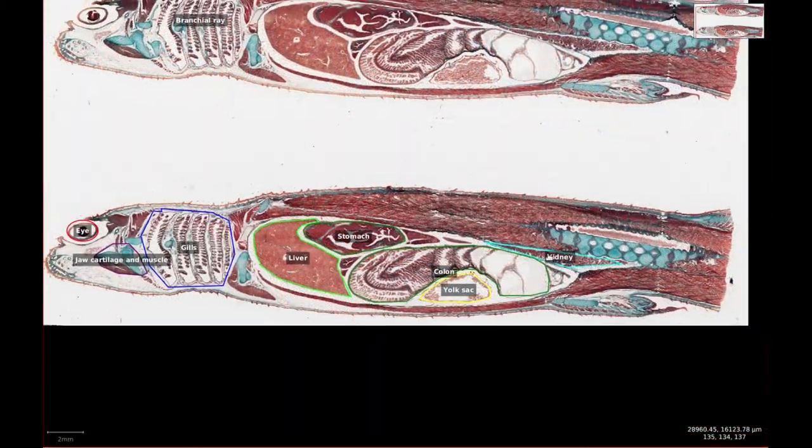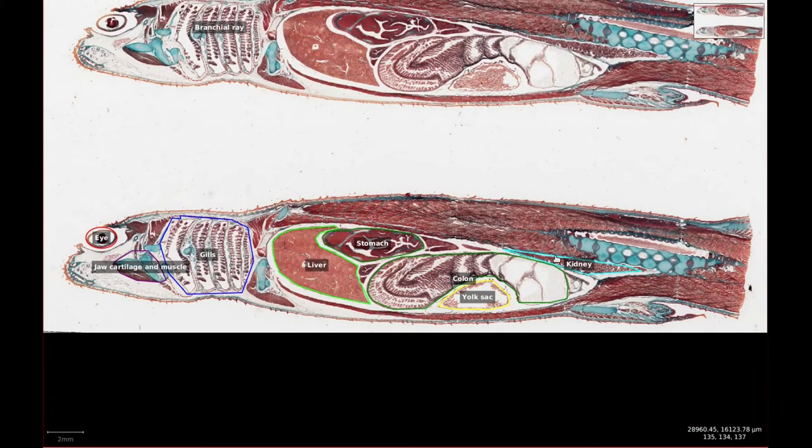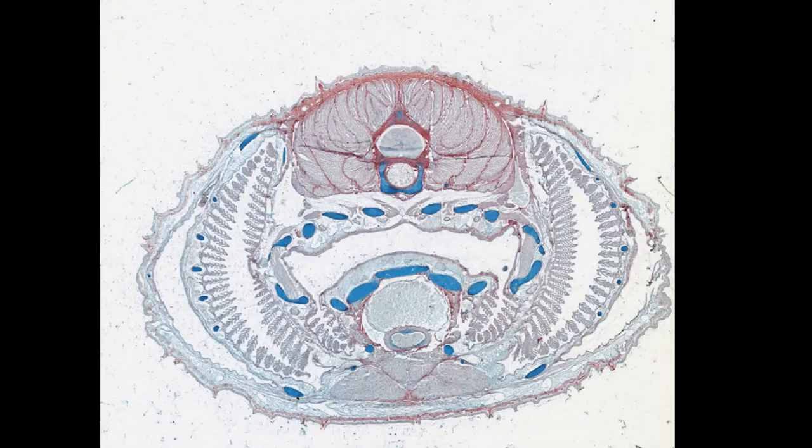So those are all the longitudinal sections and the organs you can see in each one. The transverse sections are much simpler, since slides 246 and 247 are from very similar regions but have different stains.